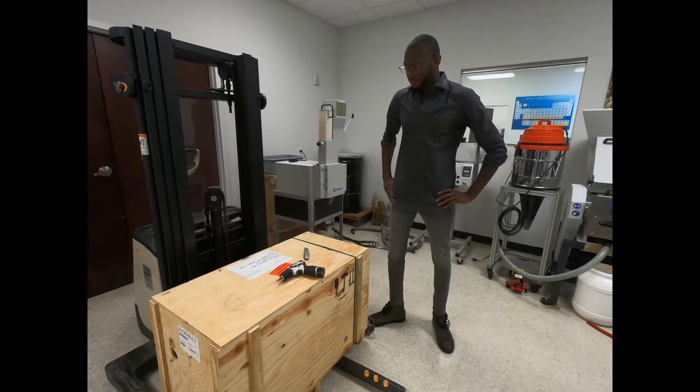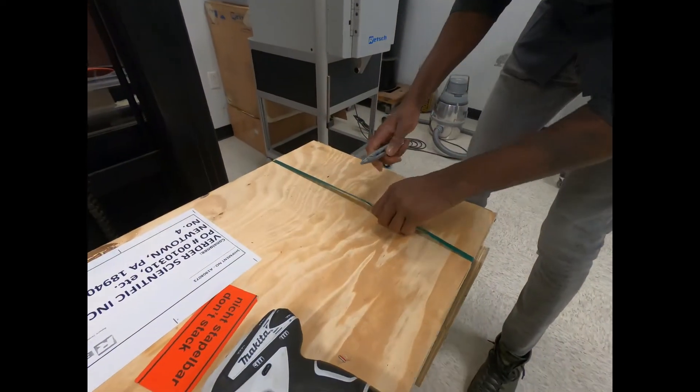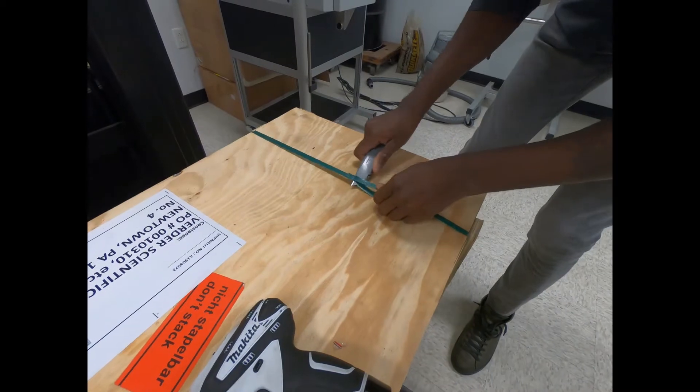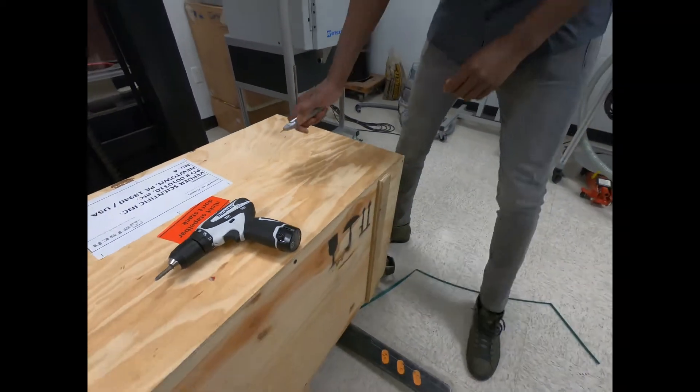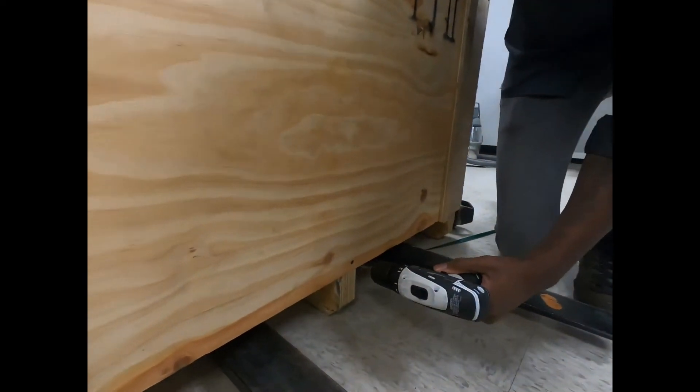To start unboxing, you're going to want to begin by cutting off these green straps, and then take your power drill and unscrew these screws on the bottom.